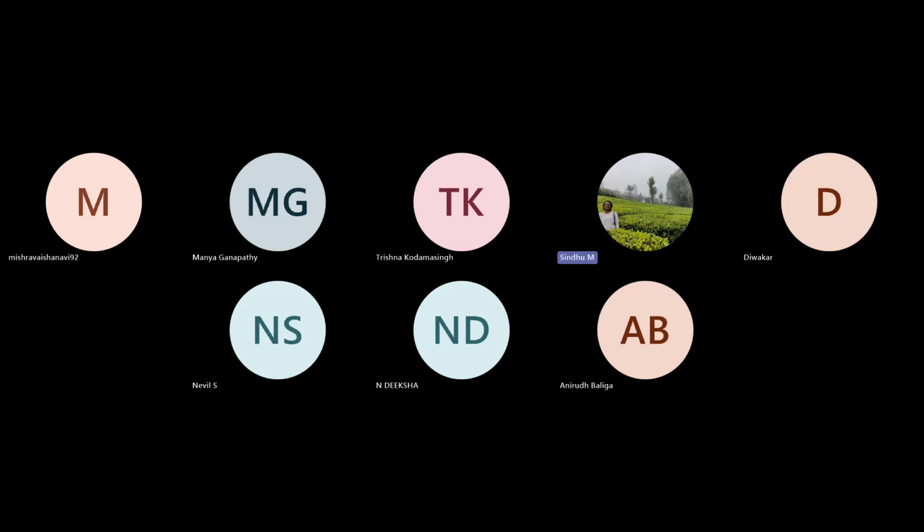All the raw data I have already exported to TIFF, so I don't have much. Maybe in the next class I will copy some raw data. Okay, I have one CZI file, but I'm not sure what experiment. Okay, let's see.